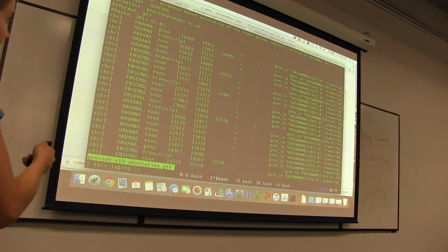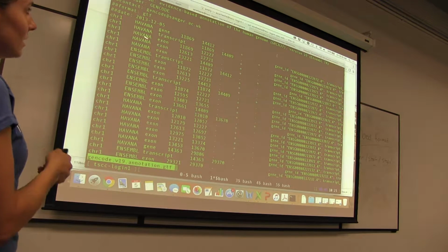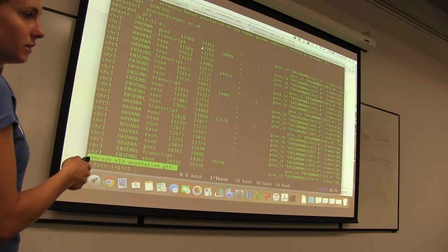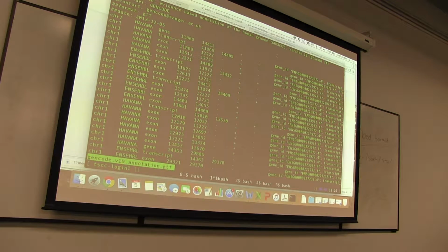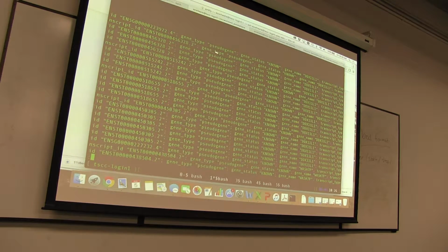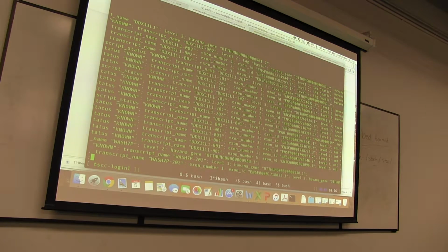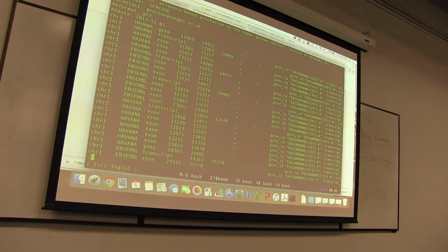The chromosome, start, stop is what you use to define where all of these things are located. So you'll see that this gene is located on chromosome 1. It has a start position here and a stop position here. This is the strand associated with that gene. If you continue to scroll over, you can see the gene ID, the status, the name, the type of transcript, and which database it was curated from. It tells you a ton of stuff, and you can read more about this on the GENCODE website to see all of the information contained here.